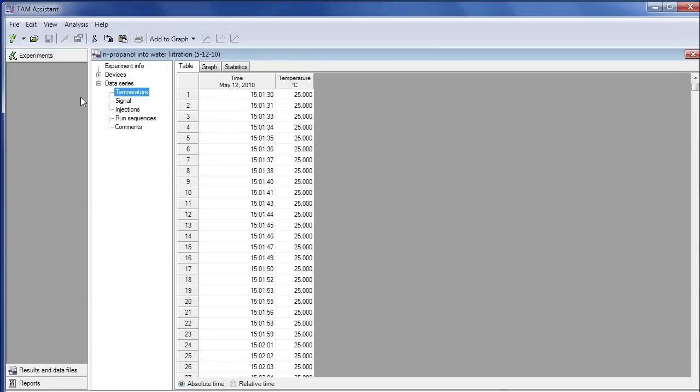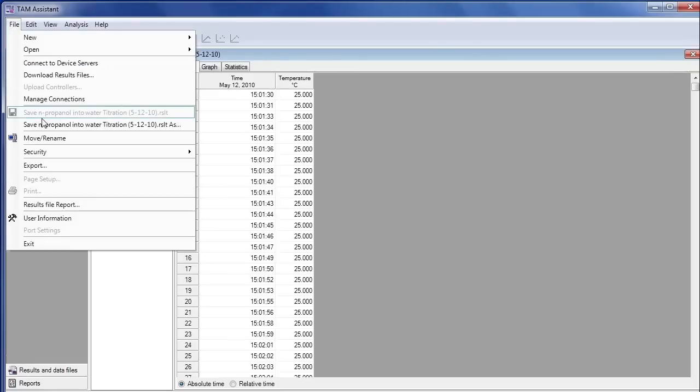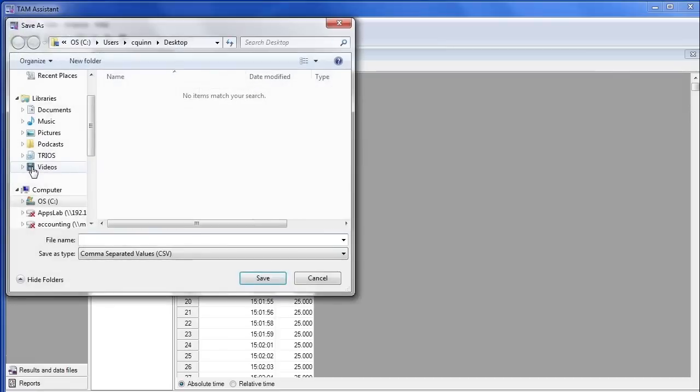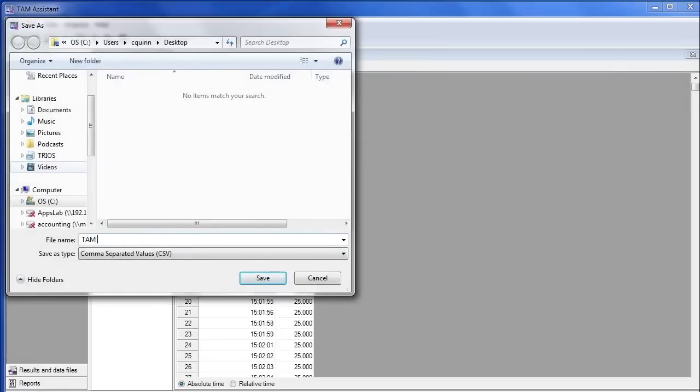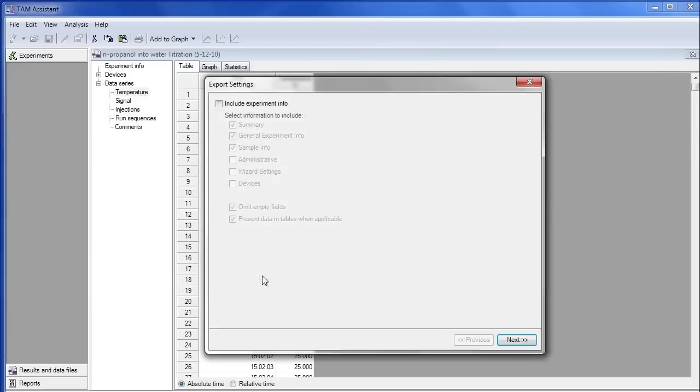After these items have been inspected, now the file can be exported from TAM Assistant by clicking on File and then Export. From here, a wizard pops up.